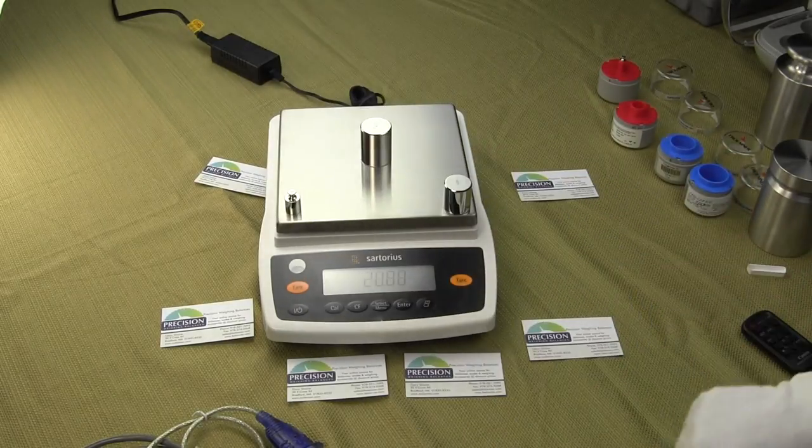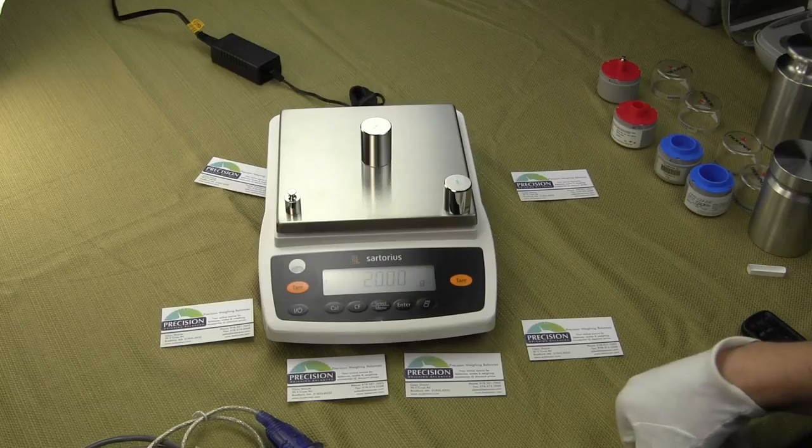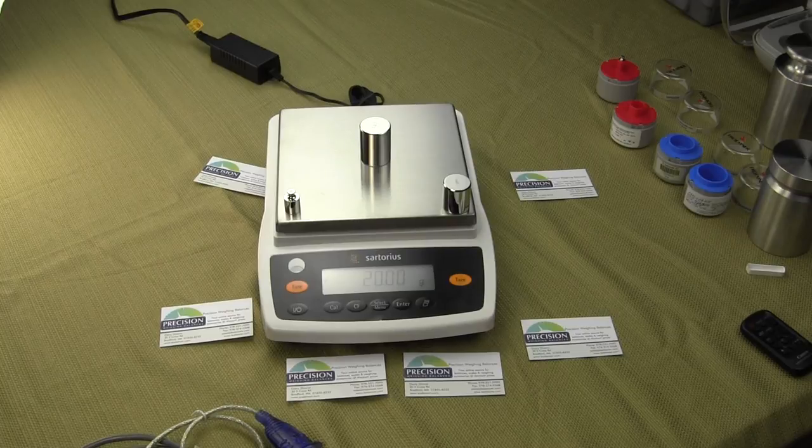This is the new Entrance Series. It's available if you visit our website at either balances.com or scaleman.com. We are an authorized Sartorius dealer. If you have any questions, give us a call.